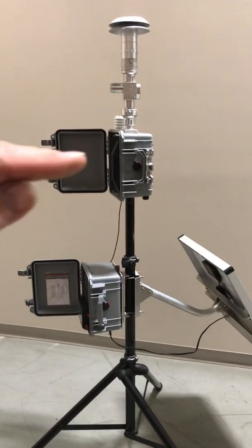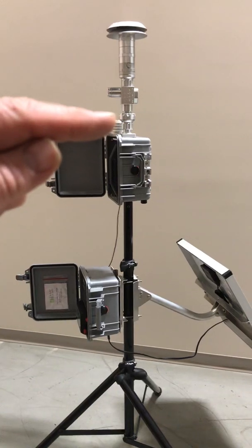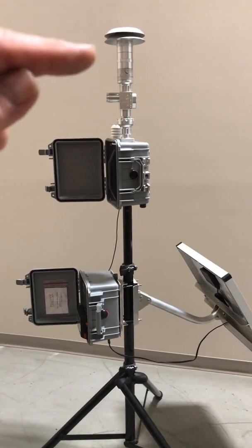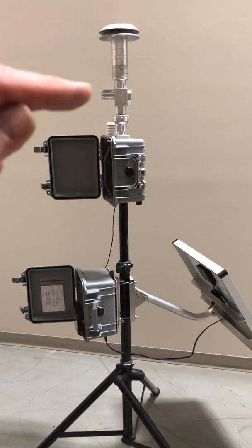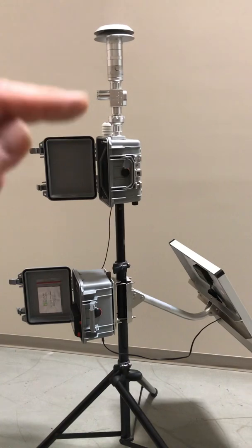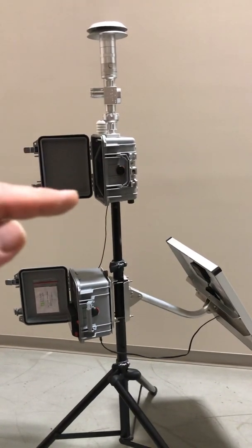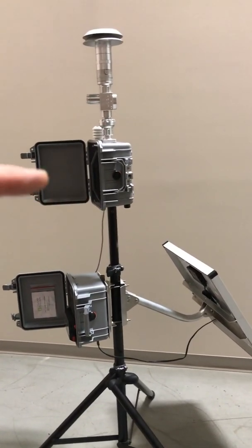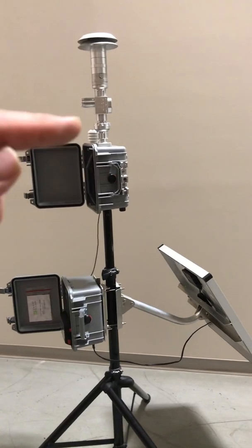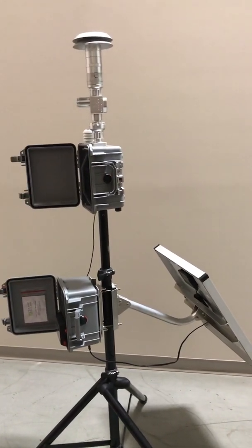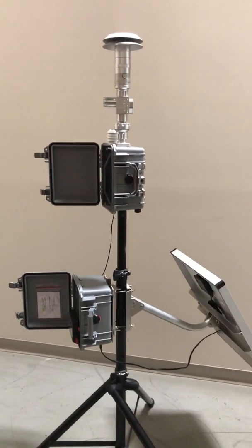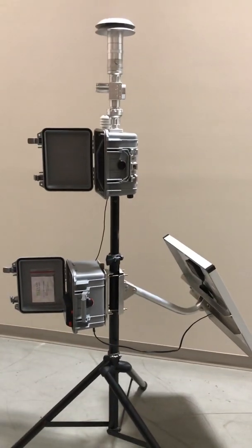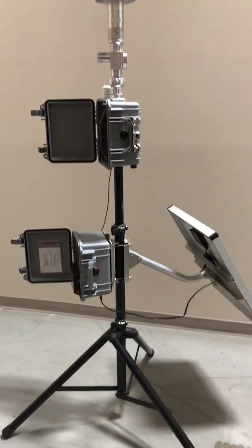There's a 47 millimeter filter in here. We have a PM10, PM2.5 configuration. It can also be set up for total suspended particulate and just simply a pump-on configuration. Draw a sample through, collects on the filter, and the operator removes the filter and sends it away for analysis, just like you would on the NAPS six-day sample schedule.